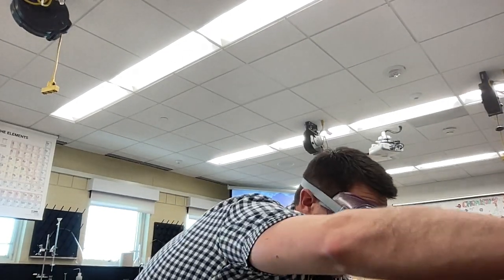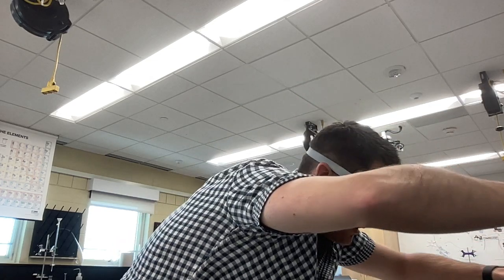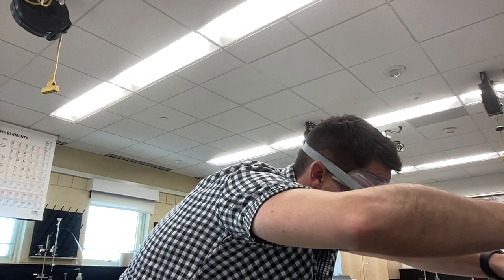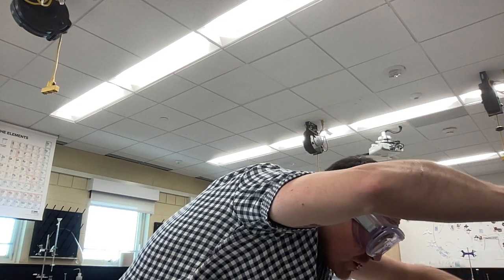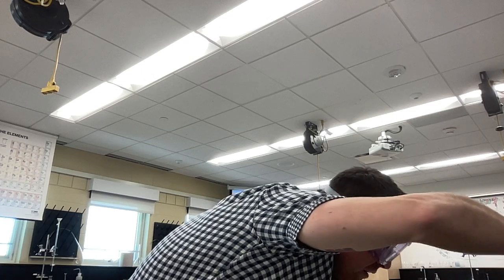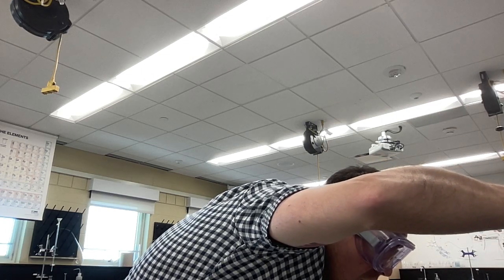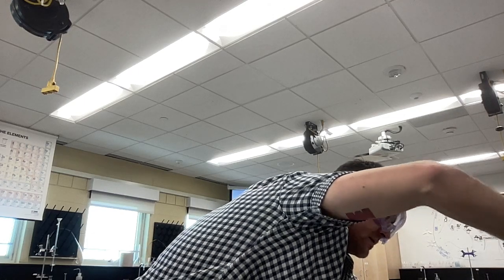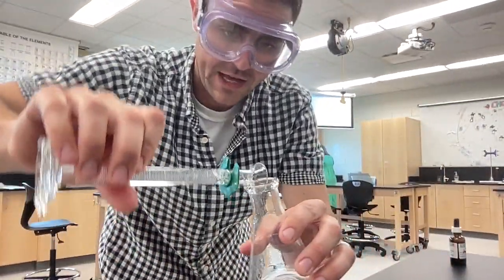What do I need? I said I needed 1 molar HCl. Let's add 10 milliliters of this stuff. Oh, too much. That's okay, I'll dump it in here. I've got an acid waste beaker right here. Okay, 10 mils HCl, dumping it in my flask.